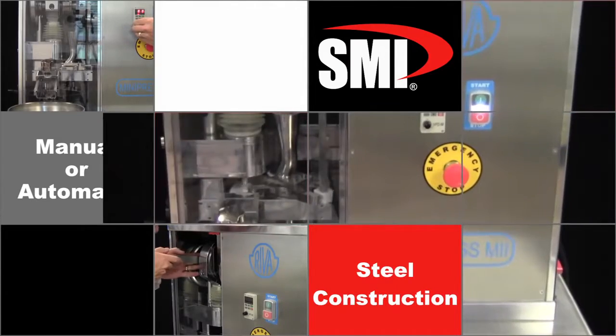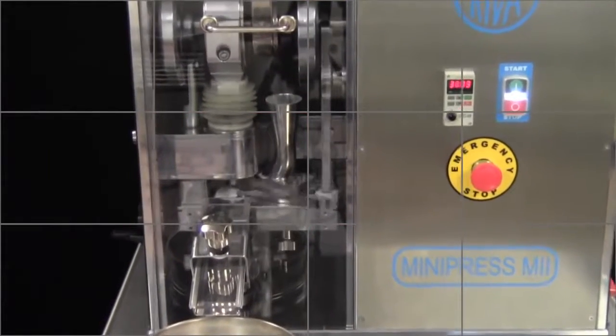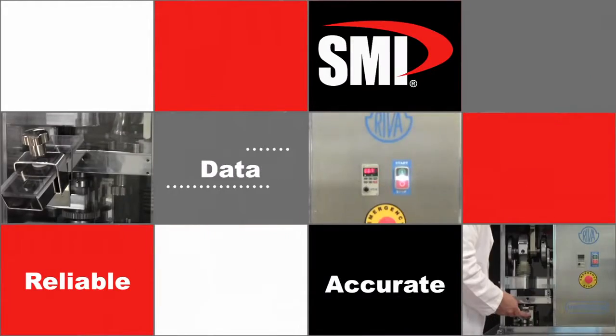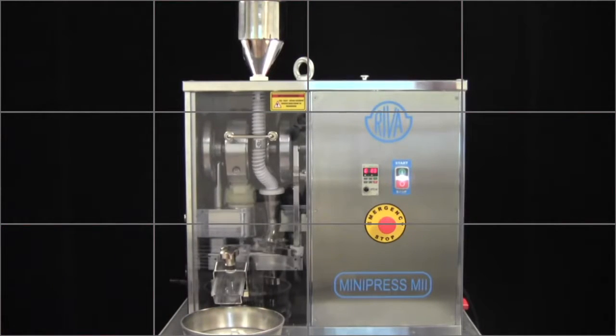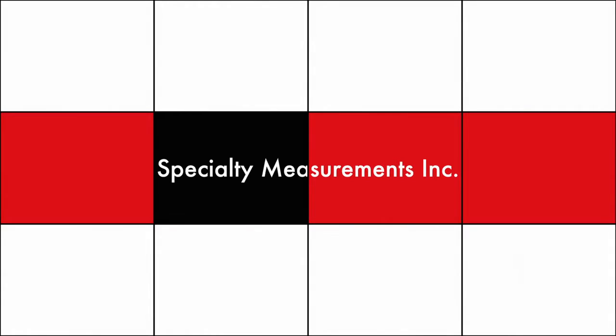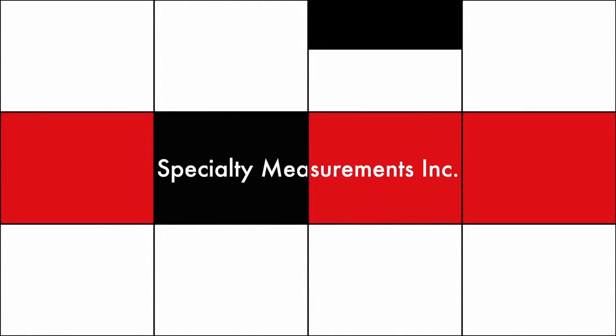With as little as 1 gram of material, a tremendous amount of information about the compressibility and strength of the resulting compact can be understood. If you appreciate Heckel plots, force displacement curves, and porosity graphs, this is the perfect machine.